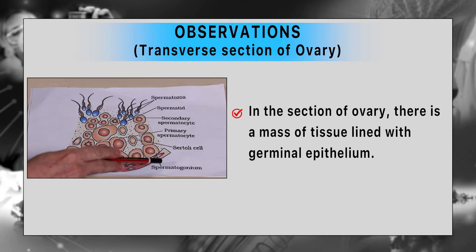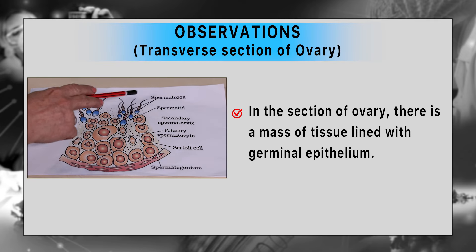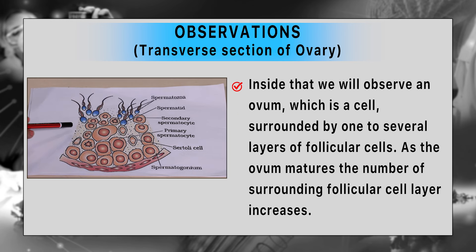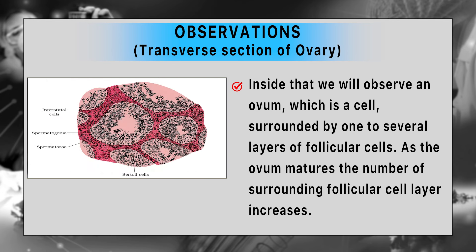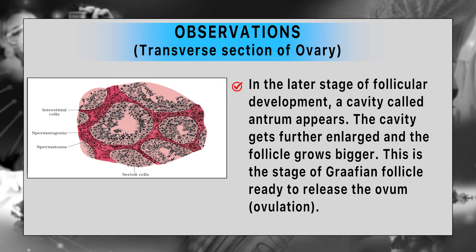Now let us observe the TS of the ovary. In the section of ovary, there is a mass of tissue lined with germinal epithelium. Inside that, we will observe an ovum, which is a cell surrounded by one to several layers of follicular cells. As the ovum matures, the number of surrounding follicular cell layers increases. In the later stages of follicular development, a cavity called the antrum appears. The cavity gets further enlarged and the follicle grows bigger.